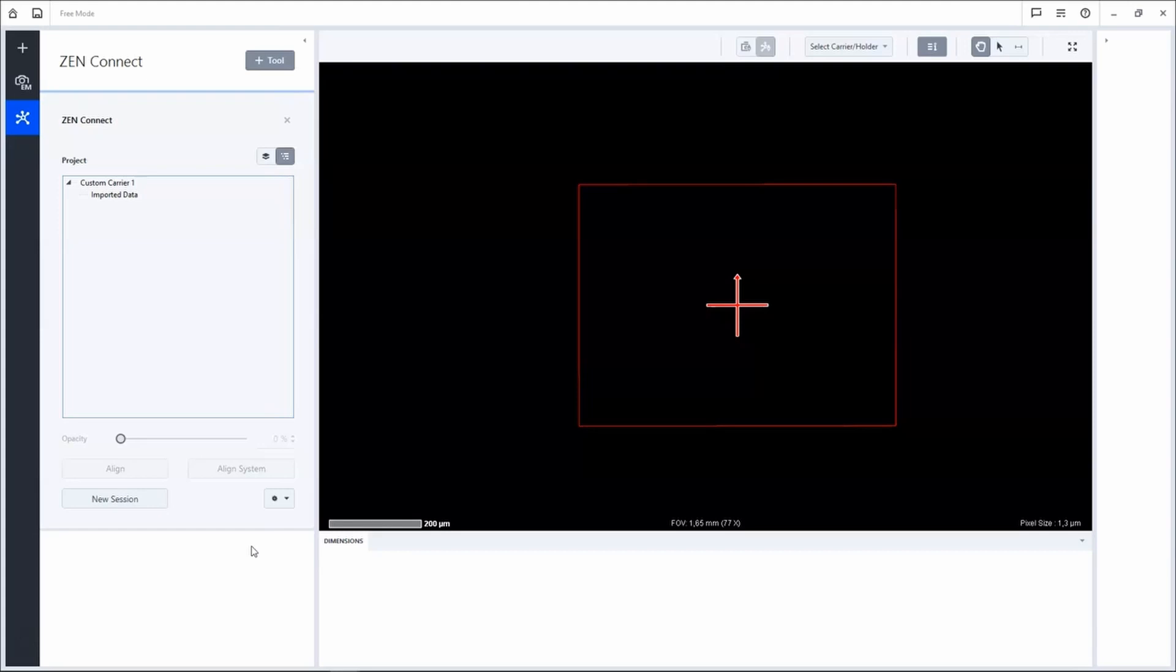Hi, my name is Ann-Kathrin. I am a Product Manager at Zeiss Microscopy and I would like to show you how to acquire images in ZEN Connect. With ZEN Connect you are able to visualize your data in context, manage your imaging sessions and correlate between your microscopes.